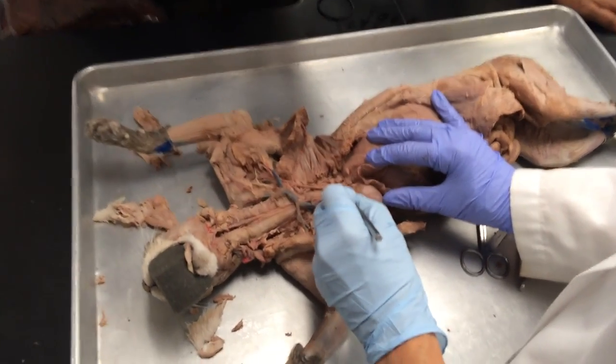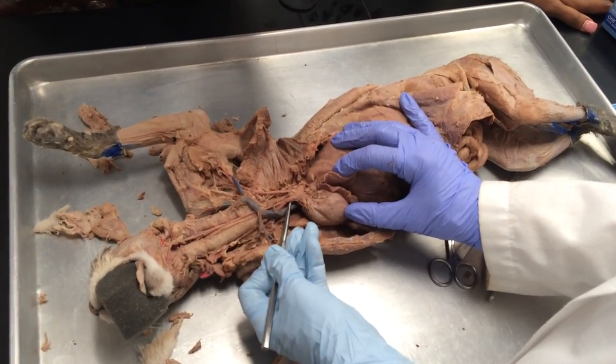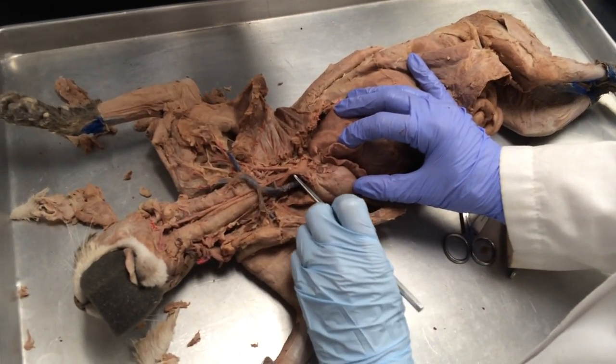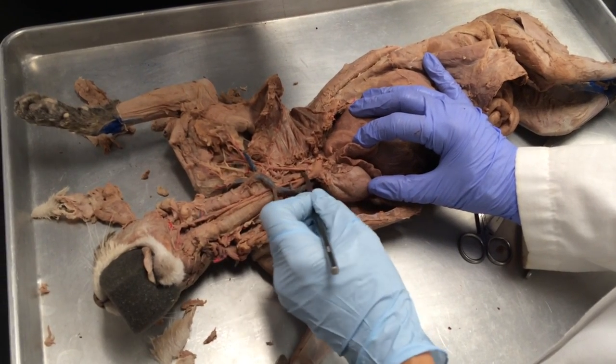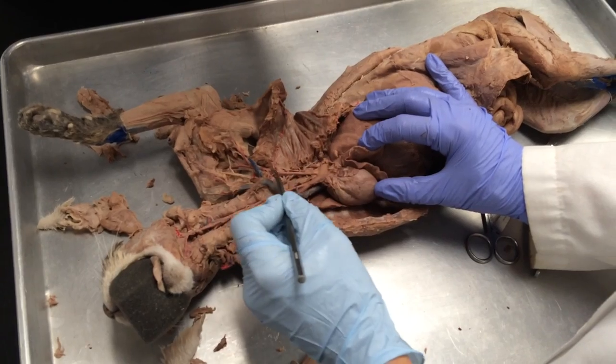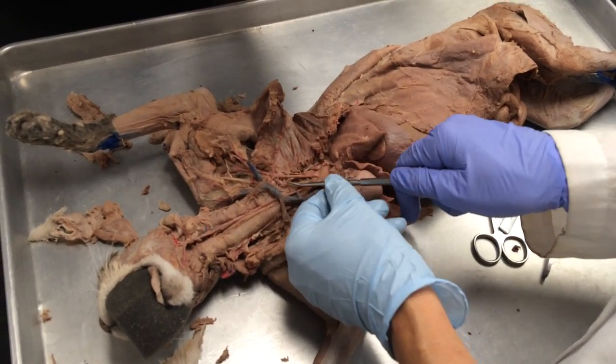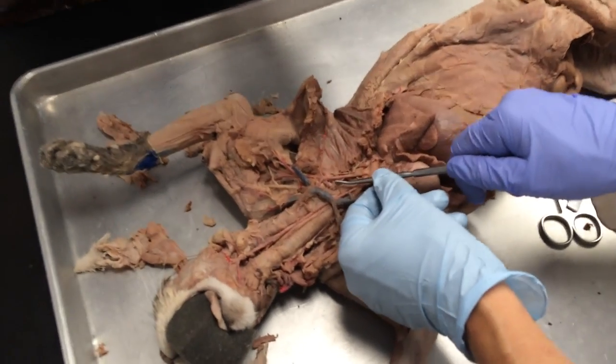Okay, here is the aortic arch. Two main branches coming off of the aortic arch of the cat. We have our right brachiocephalic and we have our left subclavian. So we're going to follow the subclavian up. So we're going to see those three sisters, we call them.